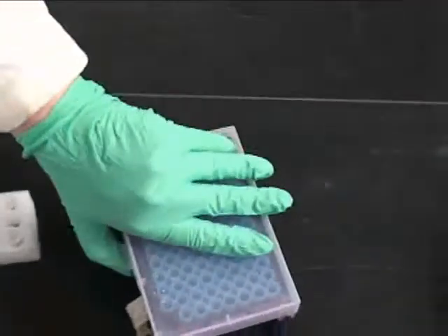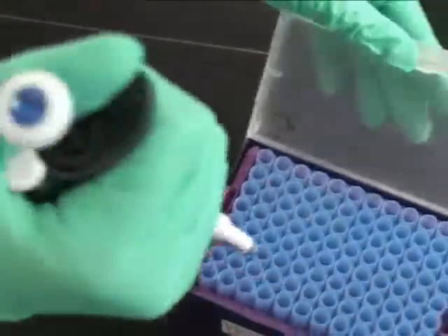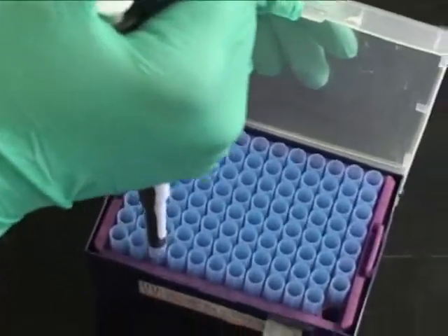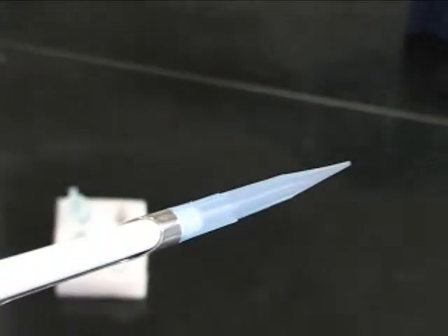To begin pipetting, open the box of tips and attach as shown. Close the box after putting a tip on to keep the tip sterile. Do not touch the tip to any surface.